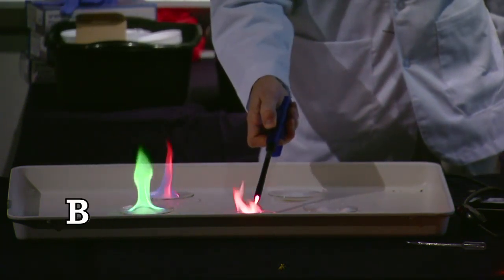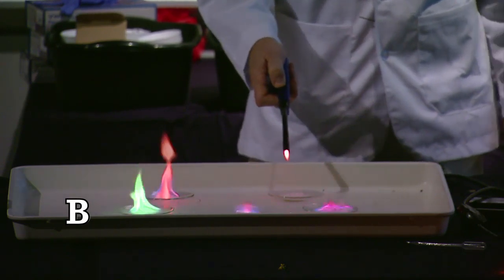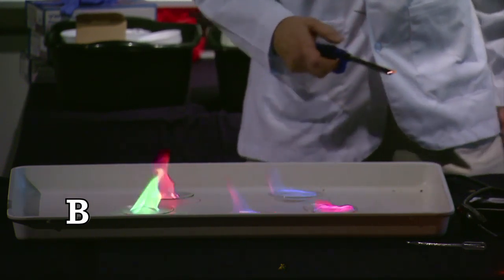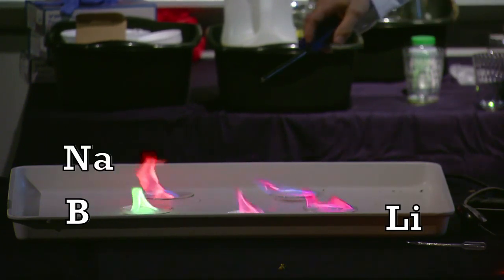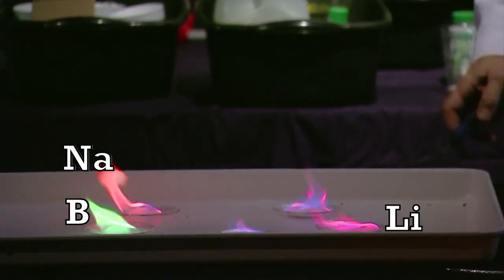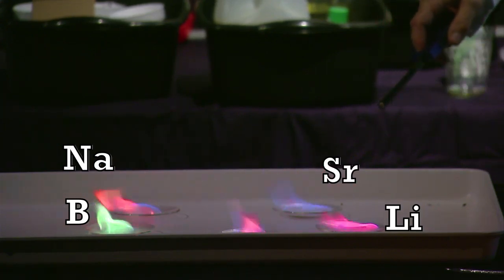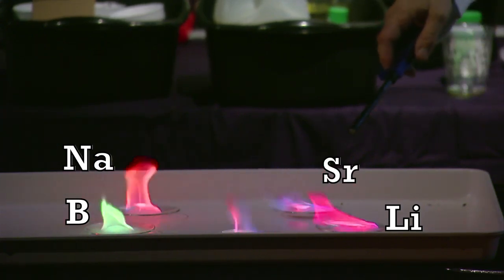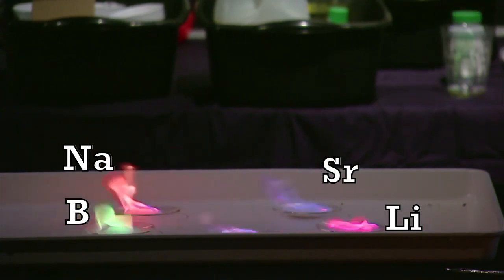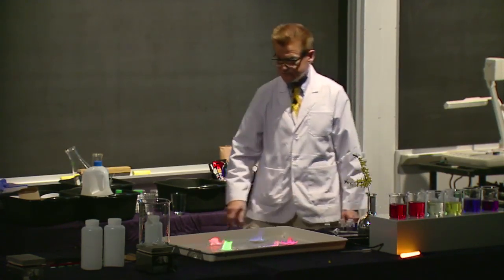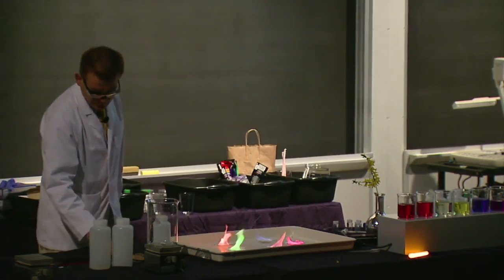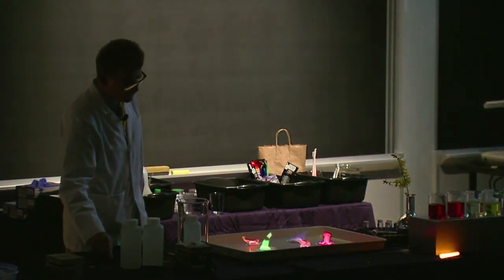So the boron is a nice green color. The lithium is a beautiful red. The sodium back here is a yellow. We've got a little bit of strontium, which is kind of the bluish red. I think the blue is probably the methanol, and the potassium is a little bit of a violet with a yellow color. Can you see those?